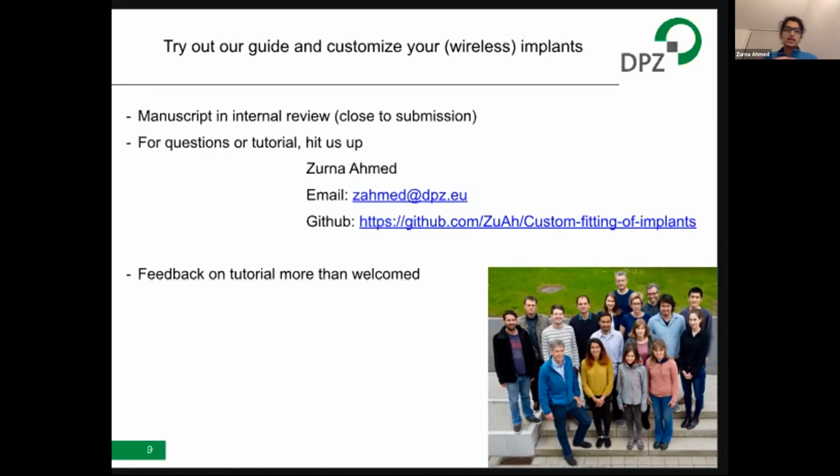There are different approaches. You can also have head posts that just have basically an MRI pole, and then you just put cement on it, and then it's adapted to the skull. But with our method with the long legs, you really want to make sure that it fits as flush as possible.